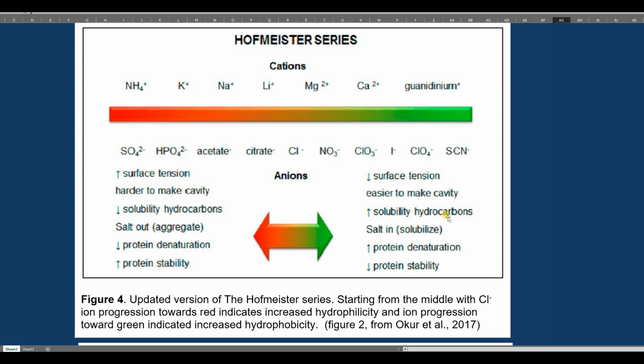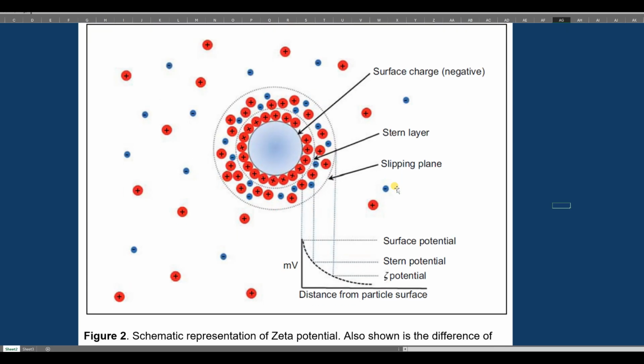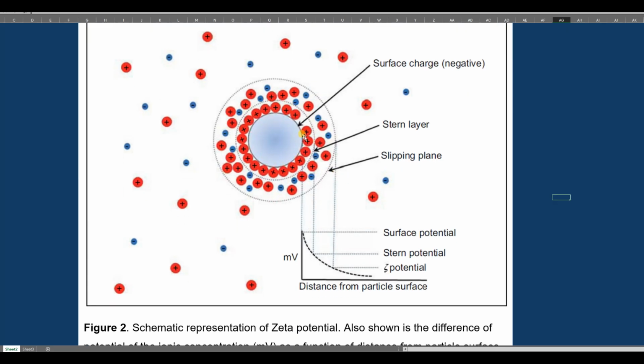Based on the levels of gasoline that's not being accounted for, as you'll see in a minute, and the actual lowering of zinc, magnesium, calcium, and whatever, I think that if we look at this picture right here, these red spheres are actually binding more around those hydrocarbons, and they're being misrepresented, aka they're being counted as being lower than they really are in solution. So that's what I'm pretty sure is happening there.